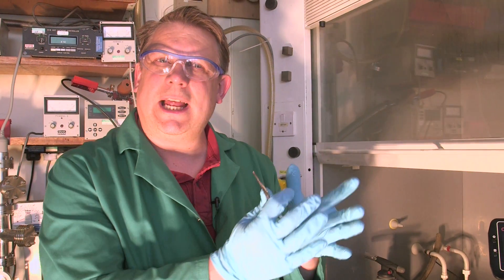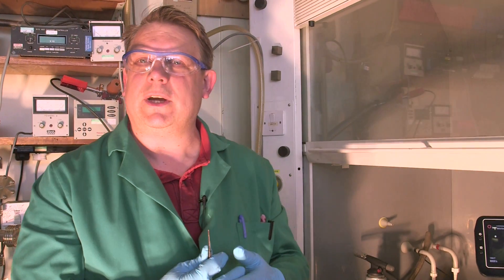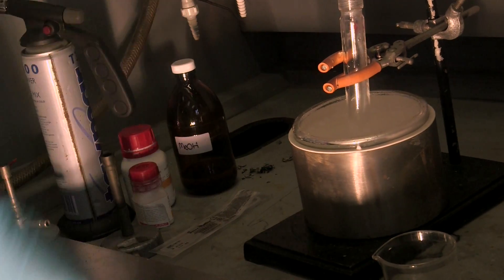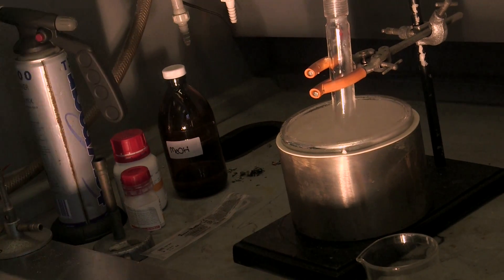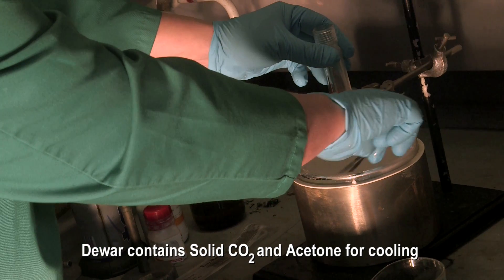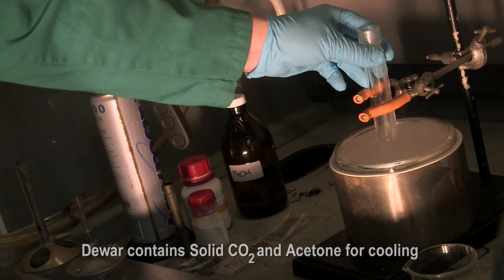That's a really unusual thing in chemistry to have just electrons themselves being solvated. Here we have a dewar, which is just like a thermos flask or something you put your cold drink or hot tea in. And in it we've got some solid CO2, dry ice, and acetone.